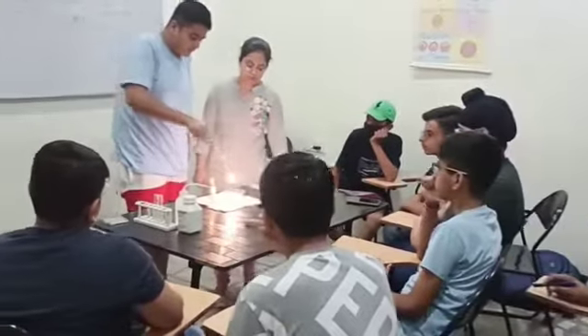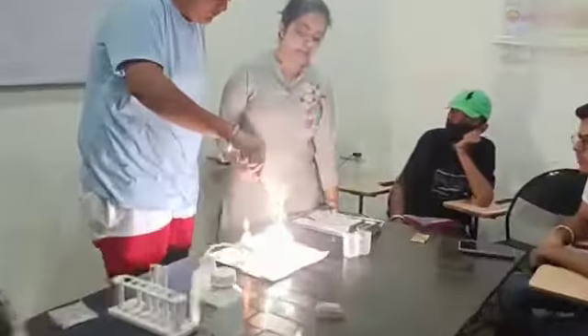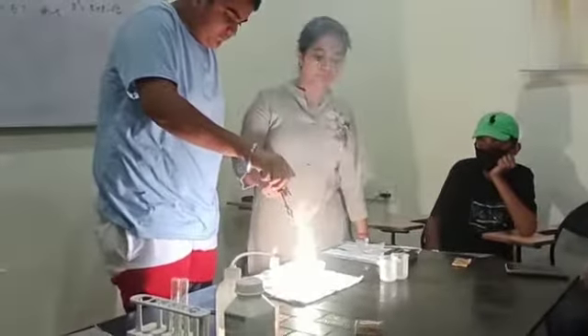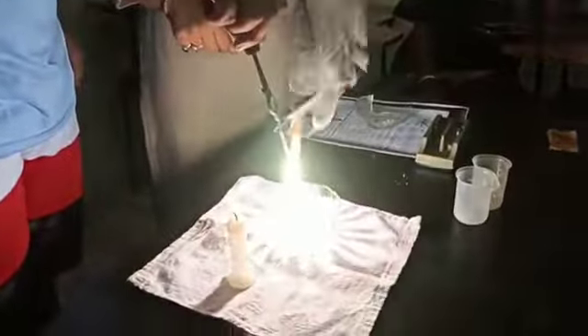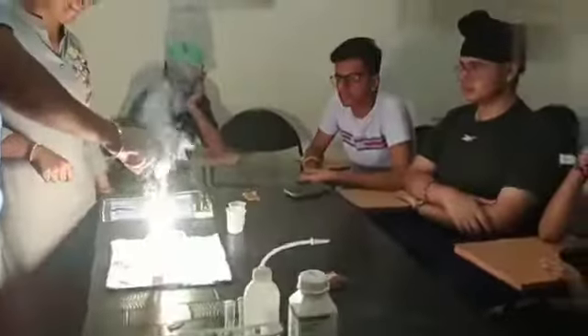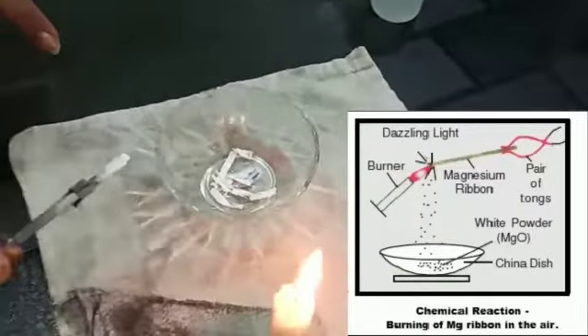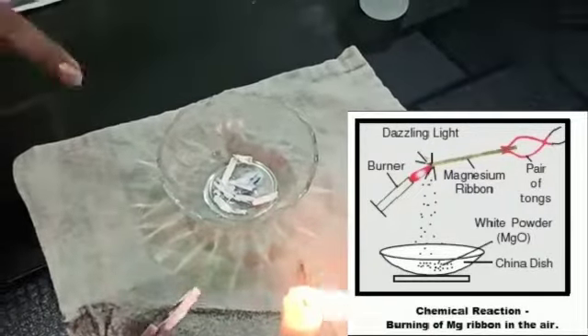We are getting the white flame. This is the bright white flame because magnesium ribbon burns with a bright white flame. This is the white ashes which is known as magnesium oxide.